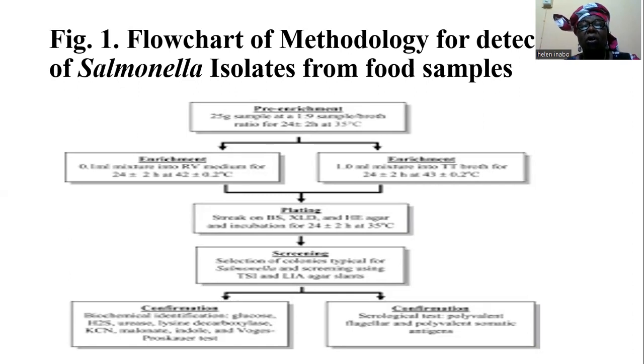Plating is now done on bismuth sulfite agar, xylose lysine deoxycholate agar, and then incubated at 35 degrees Celsius for 24 hours.